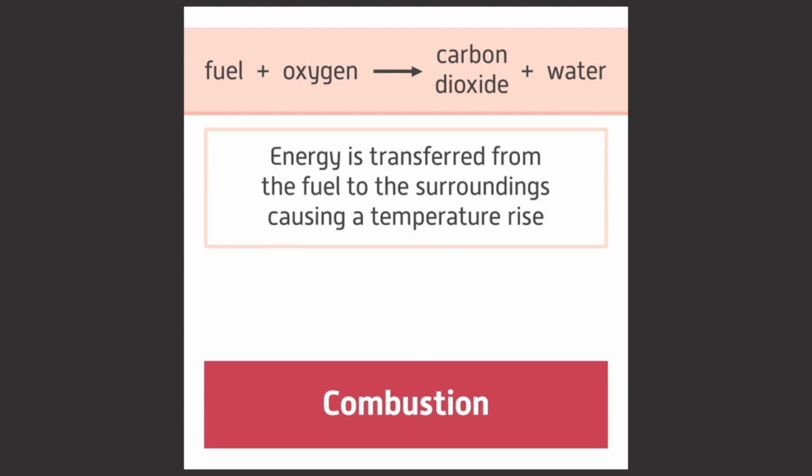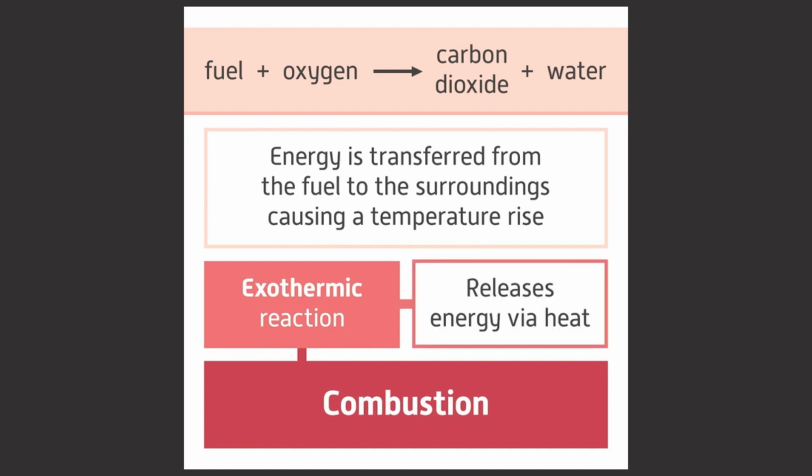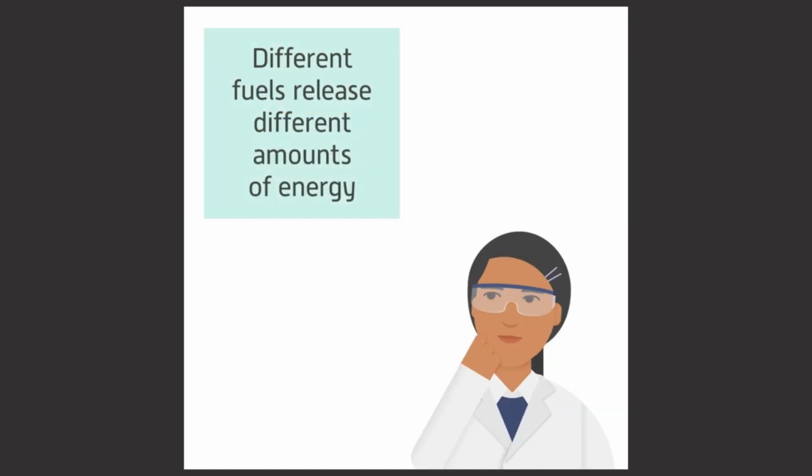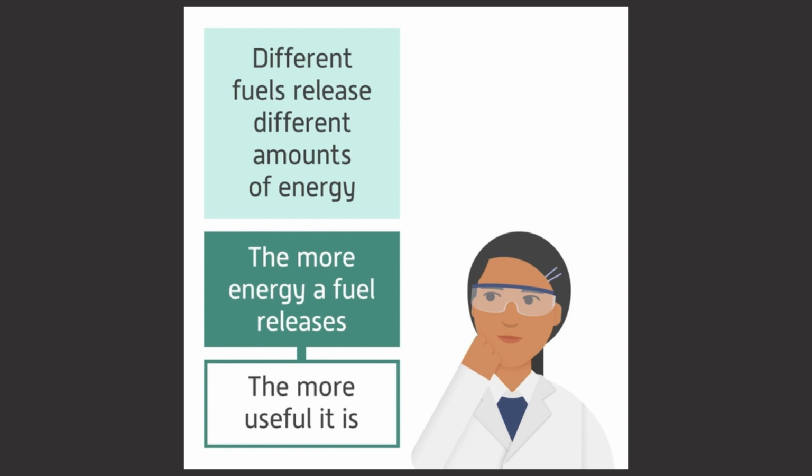Energy is transferred from the fuel to the surroundings, causing a temperature rise. We can say that combustion is an exothermic reaction. It releases energy via heat. Different fuels will release different amounts of energy. In general, the more energy a fuel releases, the more useful it is.